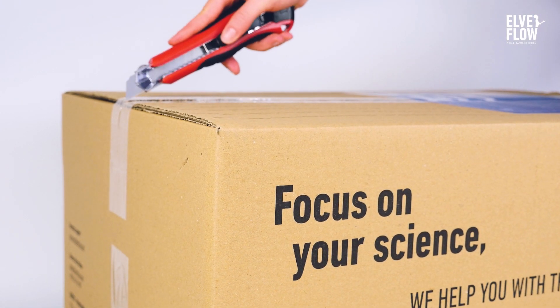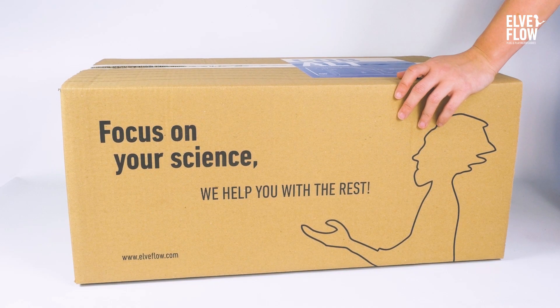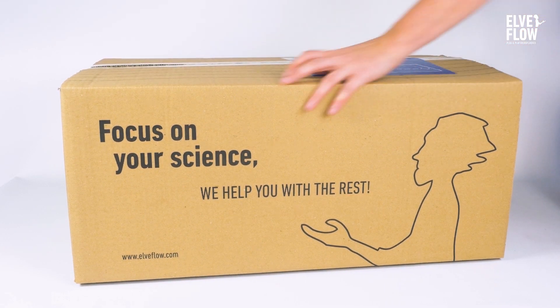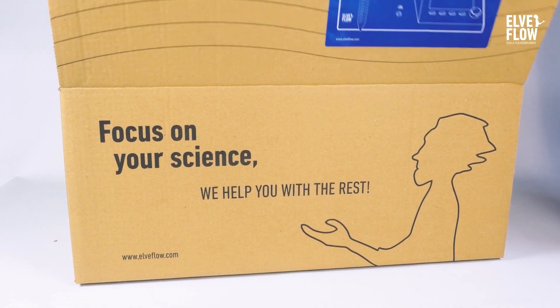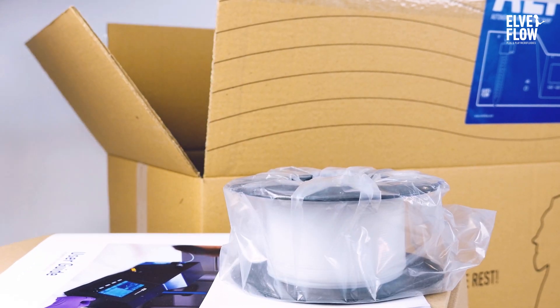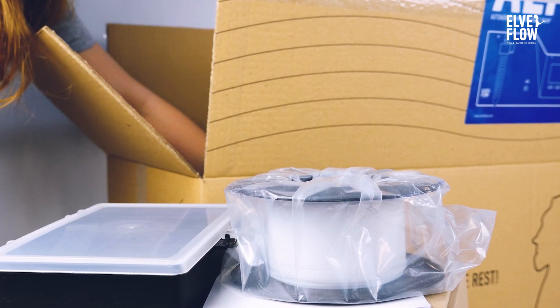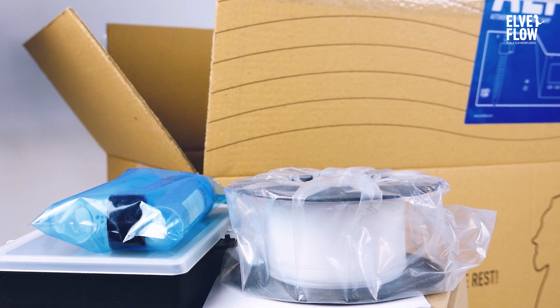Hello and welcome to the Cobalt Unboxing and Quick Start video. Cobalt is our brand new autonomous pressure controller, providing easy access to the most stable and accurate pressure and flow technology. It is a stand-alone instrument, meaning the Cobalt has an integrated pressure and vacuum source, so all you need is to connect it to a power supply and start your experiment.